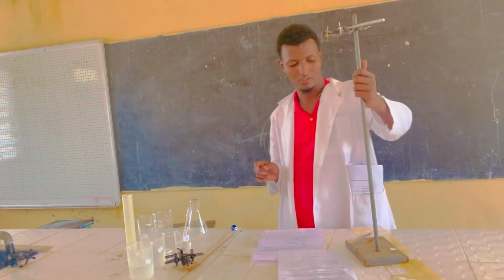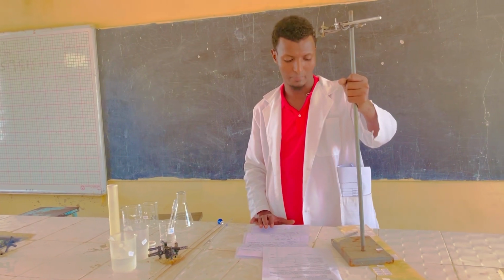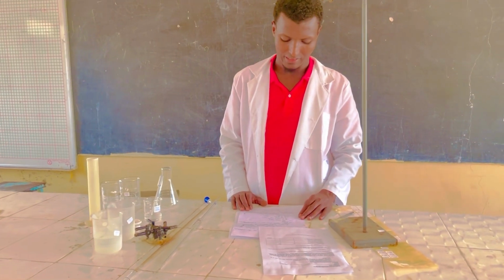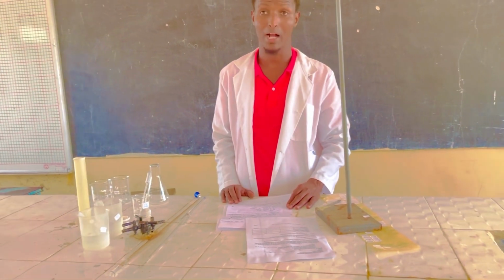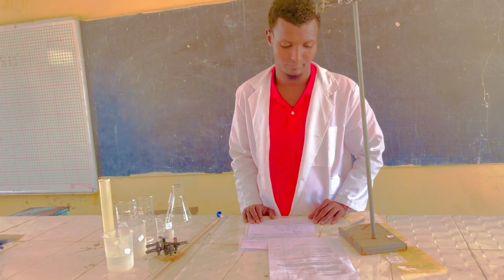And the retort stand which is used to hold the burette. You are required to determine the mass of the sodium carbonate that is used in the experiment.